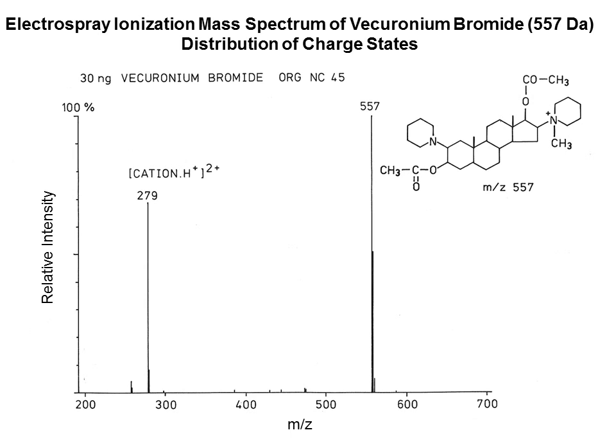What we further see is that this is not a single peak. We see at 279 two peaks, if we look carefully, close together, and at 557 we may even discern 3 peaks. As mentioned before, these multiple peaks per ion are due to isotopes, and in this case they are due to the occurrence of carbon-13 in nature. In a few minutes we'll look into isotopes and how they affect a mass spectrum.